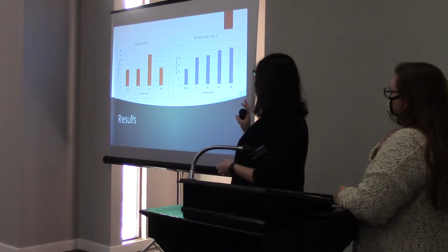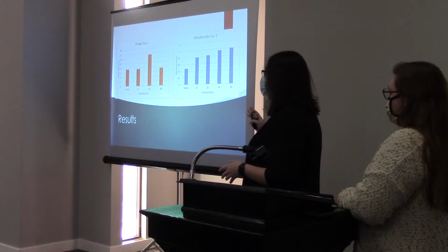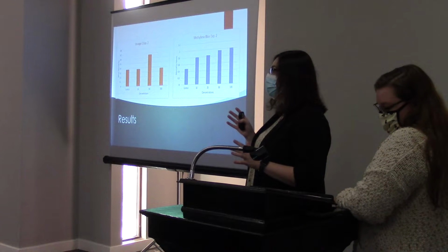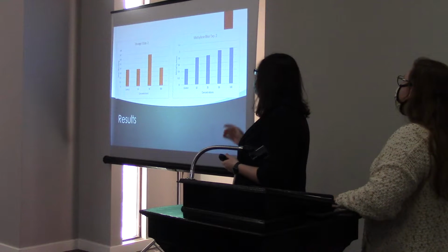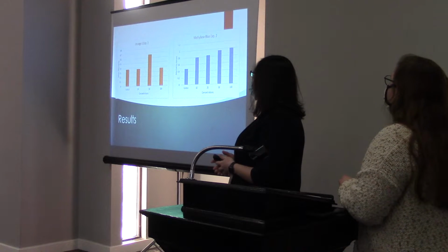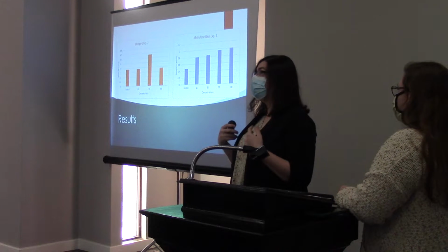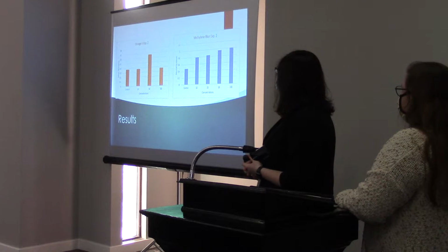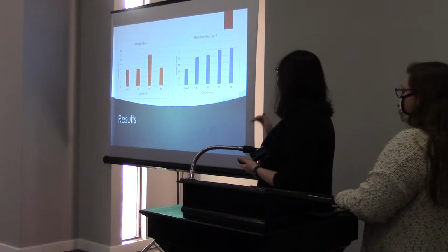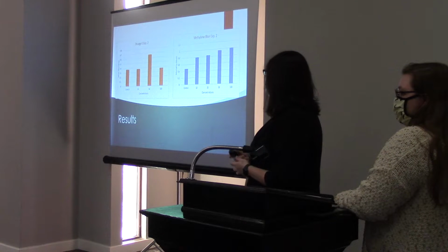And as we see from experiment 2, for orange G, minus the 50 being a little bit of an outlier, overall the mortality rates, or mortality mean, for our embryos were pretty stagnant. No real big change between each one. For our concentrations in methylene blue, however, you can see a steady incline for mortality between our embryos.